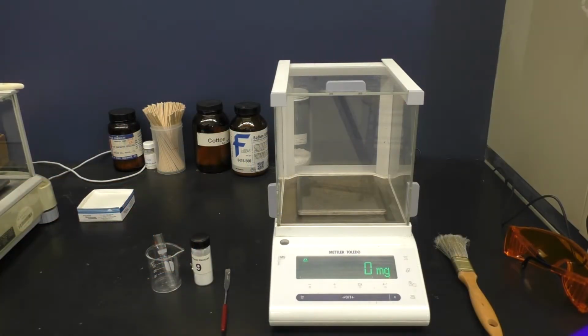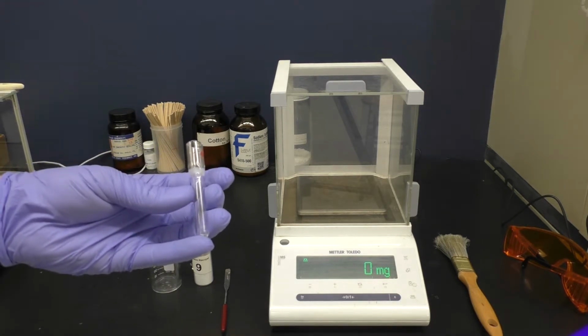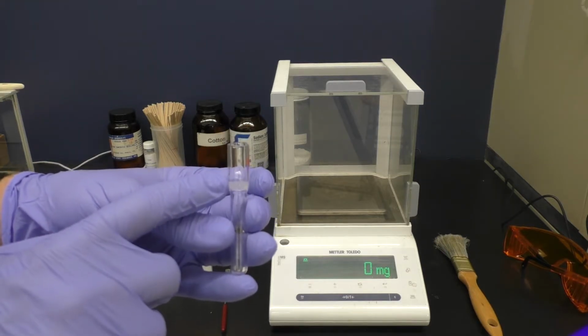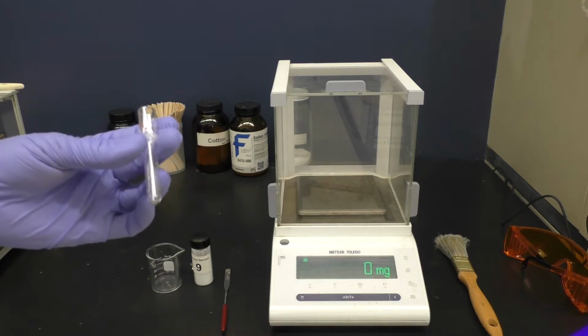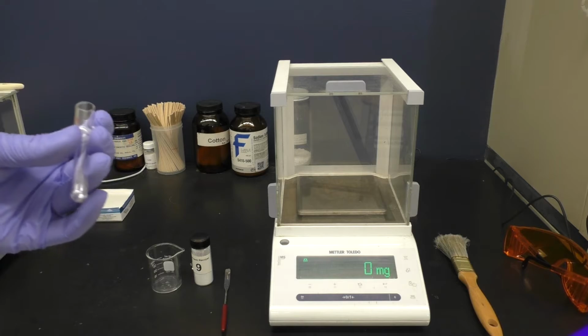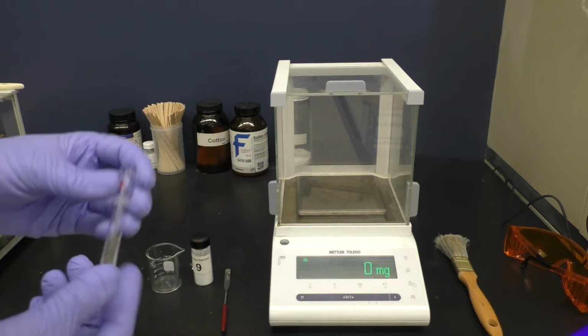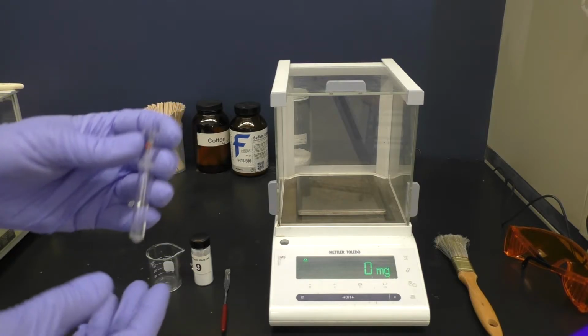To perform the recrystallization itself, we will do this in what's known as a Craig tube. Here you can see it's similar to a test tube, but it has a slightly wider neck. And we'll measure out our material into this. Now, in order to calculate a percent recovery later, we need to know the initial mass. So I will first weigh the Craig tube empty. I don't want to place this on the balance, because it won't stay very well since it's round.